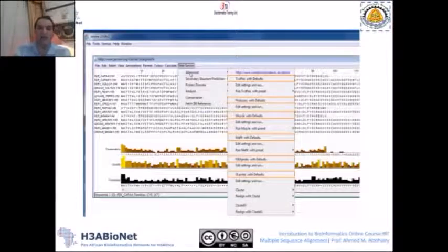Also, after aligning and reordering your sequences, you can use the web service for alignment. As we said before, you have many good aligner programs to use. You have T-Coffee, ProbCons, Muscle, MAFFT, MSAProbs, and others, and Clustal, of course.